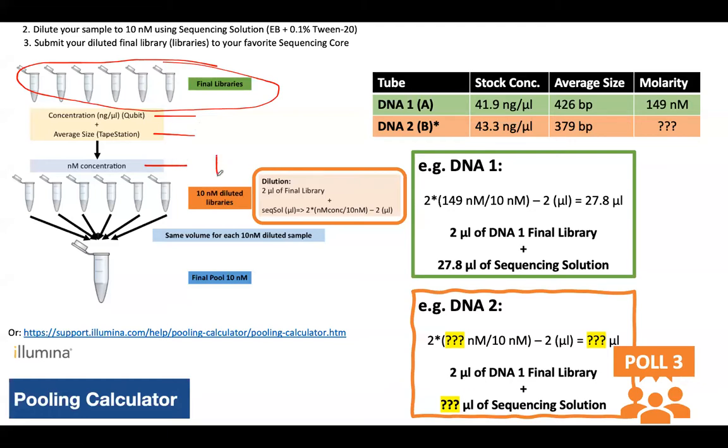So what I usually do is I dilute every library that I have to 10 nanomolar. There are different strategies to do that. I think the easiest to understand is this methodology. I dilute every sample to 10 nanomolar, and then I mix an equal volume of each sample that is already 10 nanomolar into the same final tube.